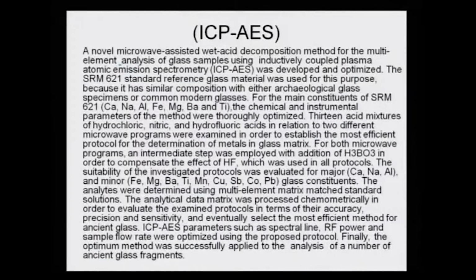For both microwave programs, an intermediate step was employed with an addition of boric acid also, in order to compensate the effect of the hydrofluoric acid, which was used in all protocols. The suitability of the investigated protocol was evaluated for major elements calcium, sodium, aluminum, and then the minor quantities that are iron, magnesium, barium, titanium, manganese, copper, antimony, cobalt and lead in the glass major constituents. So, we understand that this is one of the best methods of designing the microwave wet digestion.